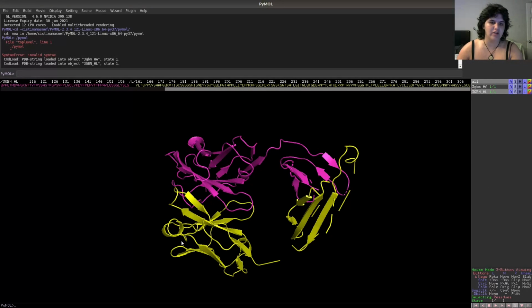The one that is binding the epitope is this region here where we have the CDR loops, and this portion of the protein is not really necessary. We want to remove it, one, because it's very low resolution, we have missing residues and broken chains, but two, because we want to make the calculation time faster. So the smaller the protein, the better it is.